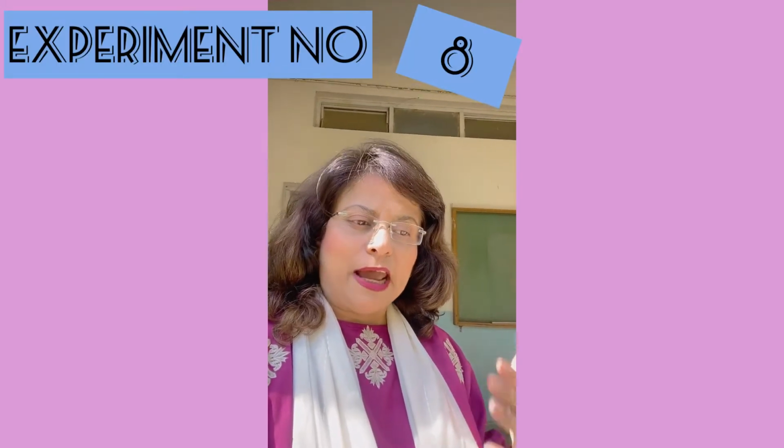They have been given 8 experiments in this first semester coursework, and I'm very happy to share that we are the first ones to complete our coursework within the due period of time. Today my students are performing the 8th experiment. In this semester, they need to identify 8 different organic compounds. Today is the last experiment, the last organic compound they are identifying and verifying through different steps.